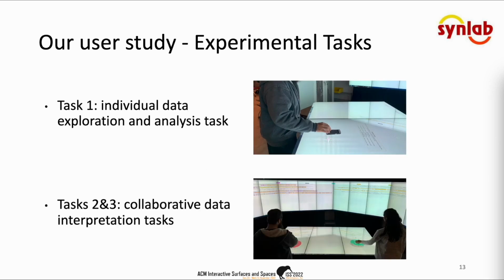Our biology team members created a realistic but synthetic data set to provide users with a task scenario that was manageable within the time frame of a user study. Since chromatin data is complex and researchers typically need to spend time exploring it on their own before discussing with collaborators, participants were given free exploration time, followed by related tasks for this study.